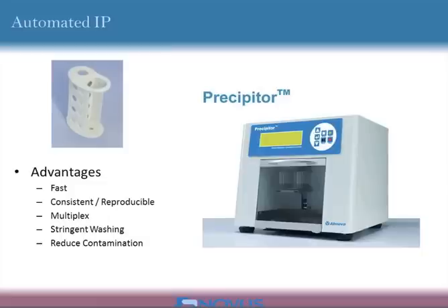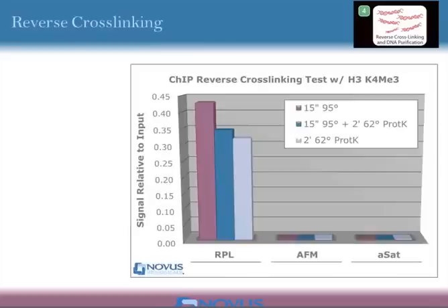Since you are not there for every single step, and for this ChIP procedure here, we've got at least 6 different wells with 6 different steps with your different concentrated salt buffers and your elution buffers, that every time you're obviously interacting with those tubes, you could be contaminating them. And these machines can also be used for purification assays if you use that in your lab.